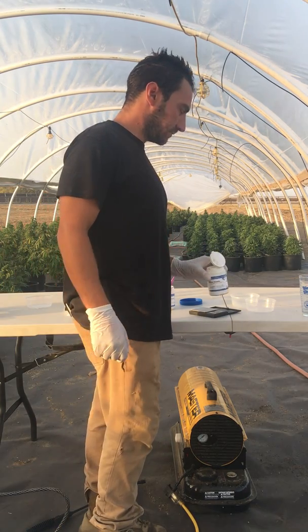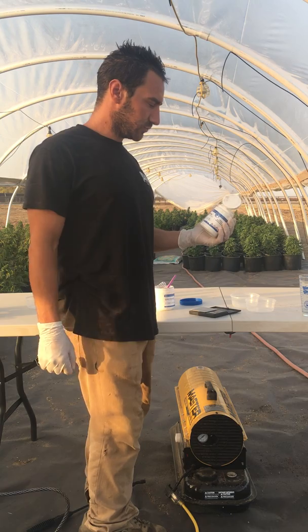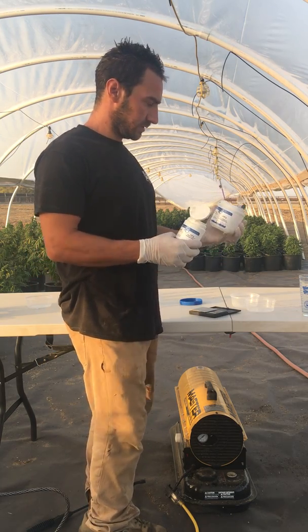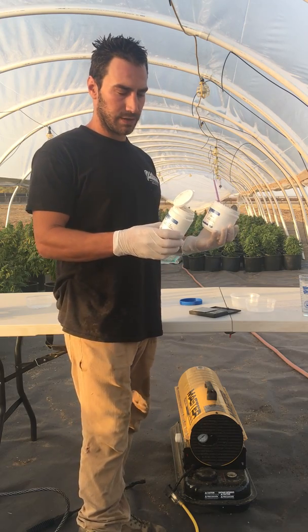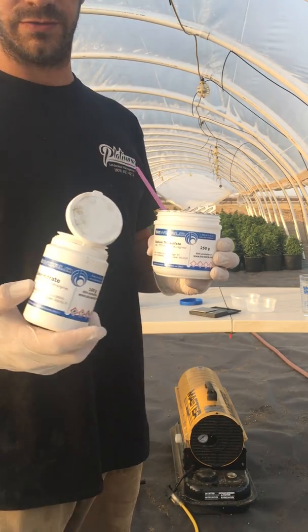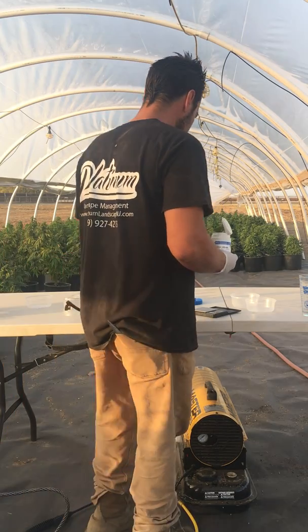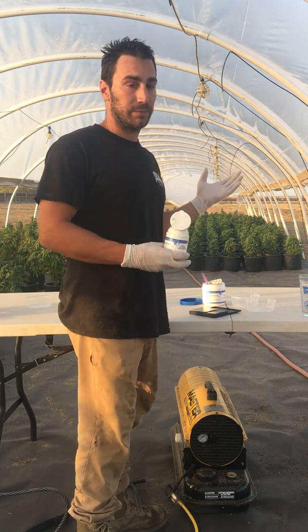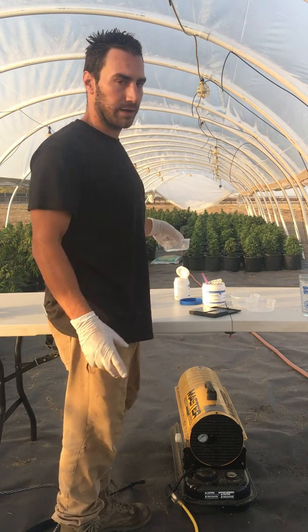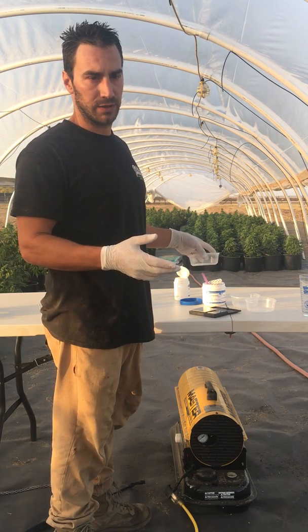Hello YouTubers and fellow cannabis and hemp growers. Today I'm going to show you how to make a mixture called colloidal silver with sodium thiosulfate and silver nitrate. The reason I'm doing this video is because I've been shown a lot of different methods by different people and almost all of them have been wrong. Through trial and error, I've figured out this is the best way to do it and I've gotten really good results with it.